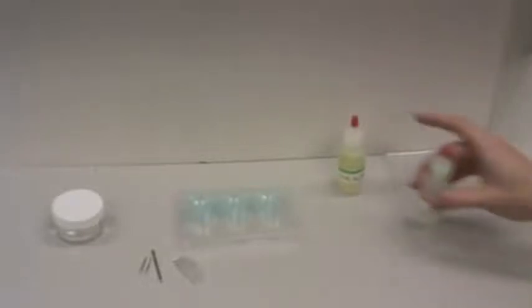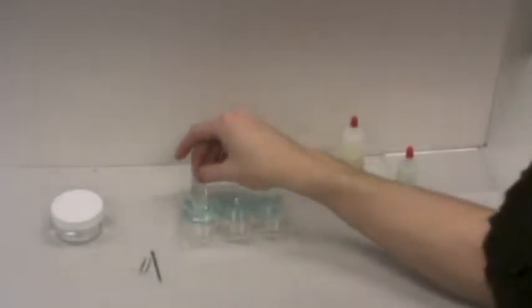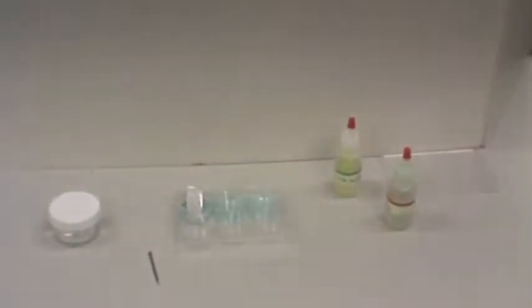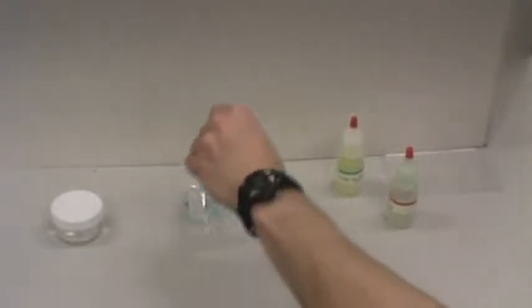Place one end of the aluminum strip into the solution in well 1 and let it sit there. Bend a paper clip so that it forms an L shape and place it into the solution in well 2. Put one end of the iron nail into the solution in well 3.